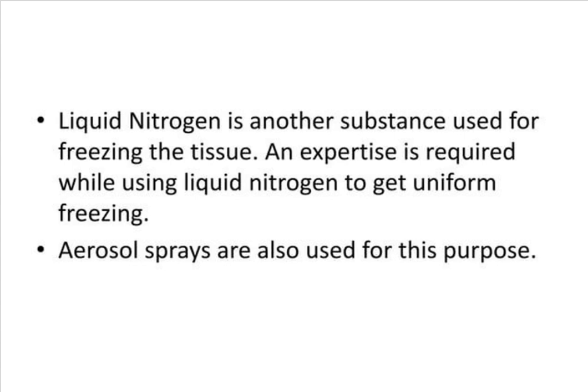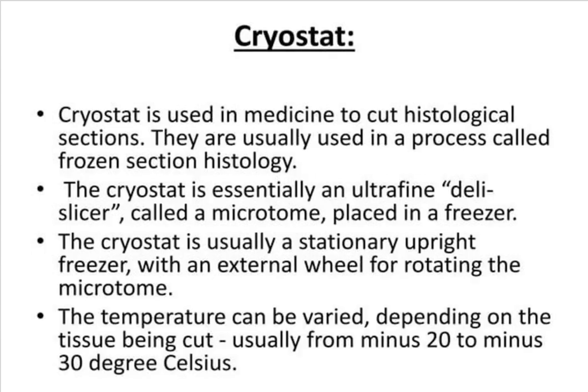Liquid nitrogen can be used for freezing the tissue, and it takes expertise to get a uniform freezing. And the major discovery now is the aerosol spray. Beyond liquid nitrogen and carbon dioxide, these aerosol sprays keep the cell clean, and it does not distort any of the structures in it.